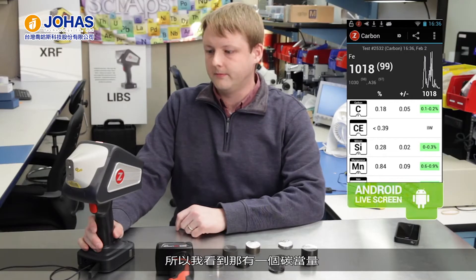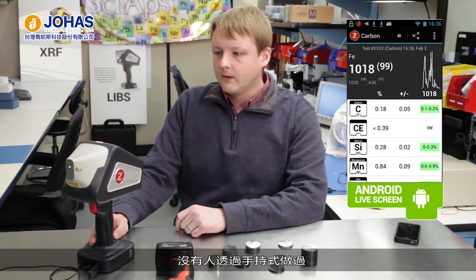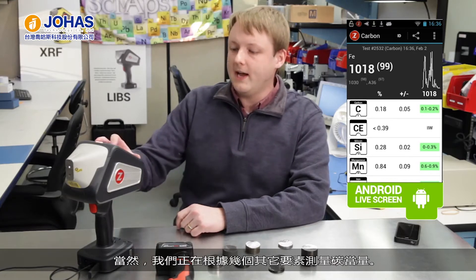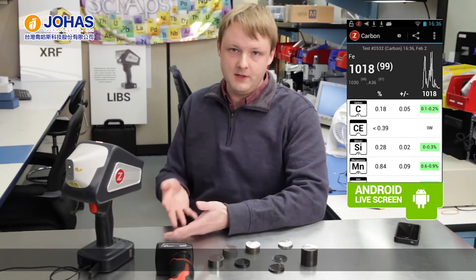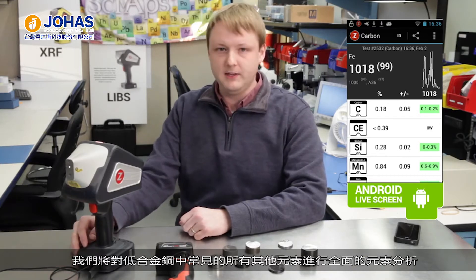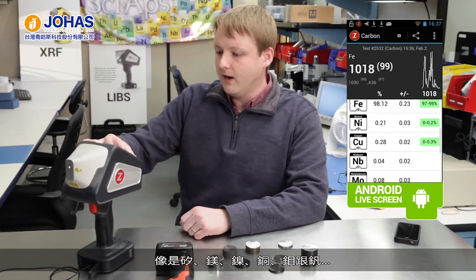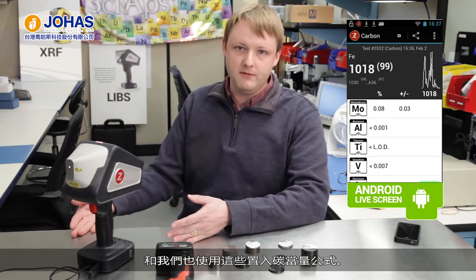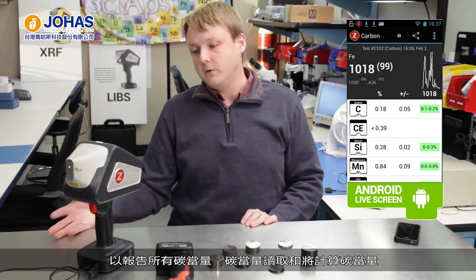We're also showing carbon equivalence in this software, which is also unique — nobody does that with a handheld either. We're calculating the carbon equivalence based on the results for a few other elements. Even though this is carbon mode, we're doing a full elemental analysis of all the other elements that commonly show up in low alloy steel — silicon, manganese, nickel, copper, moly, and vanadium. We use all of those to plug into the carbon equivalence formula to report a total carbon equivalence reading.